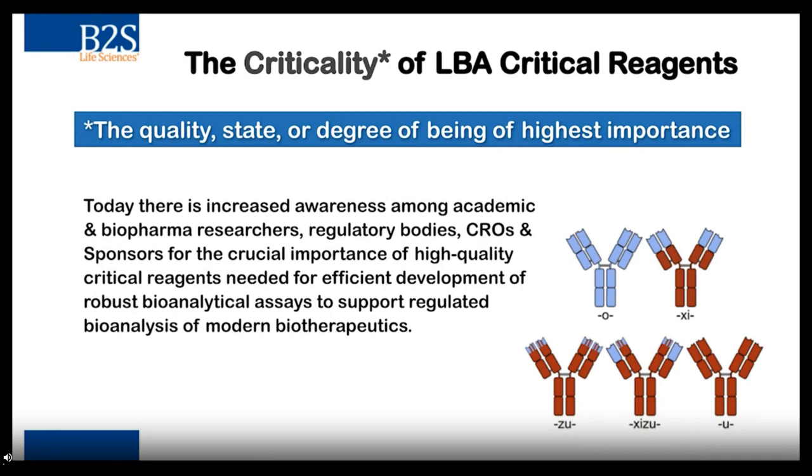Okay. To begin, our focus is on critical reagents, and I like to talk about the criticality of critical reagents. And what I mean there is this: the definition is the state or quality or the degree of something being of highest importance.